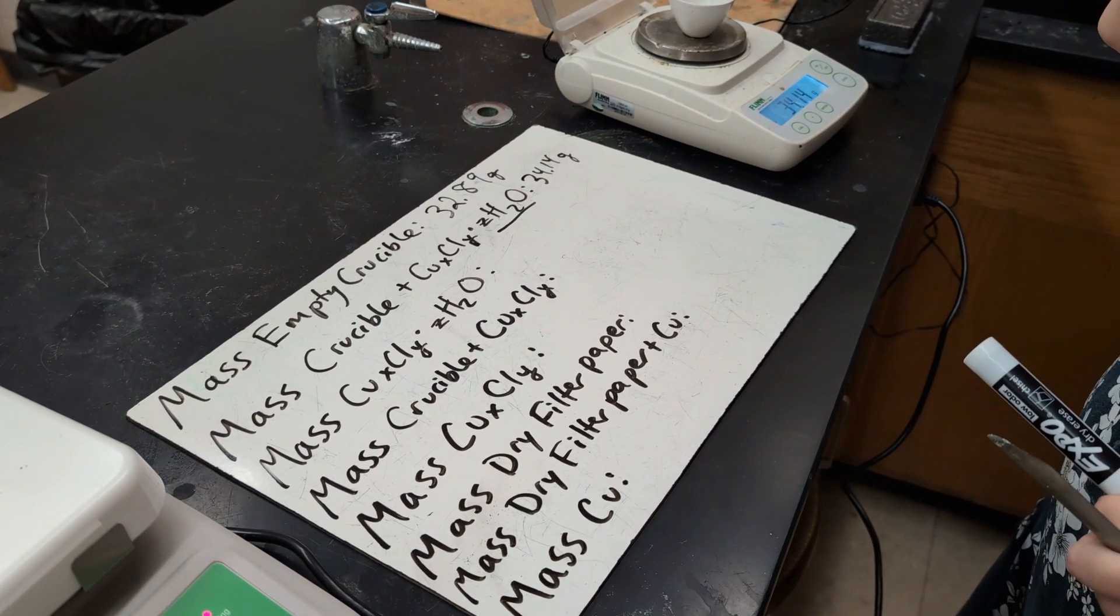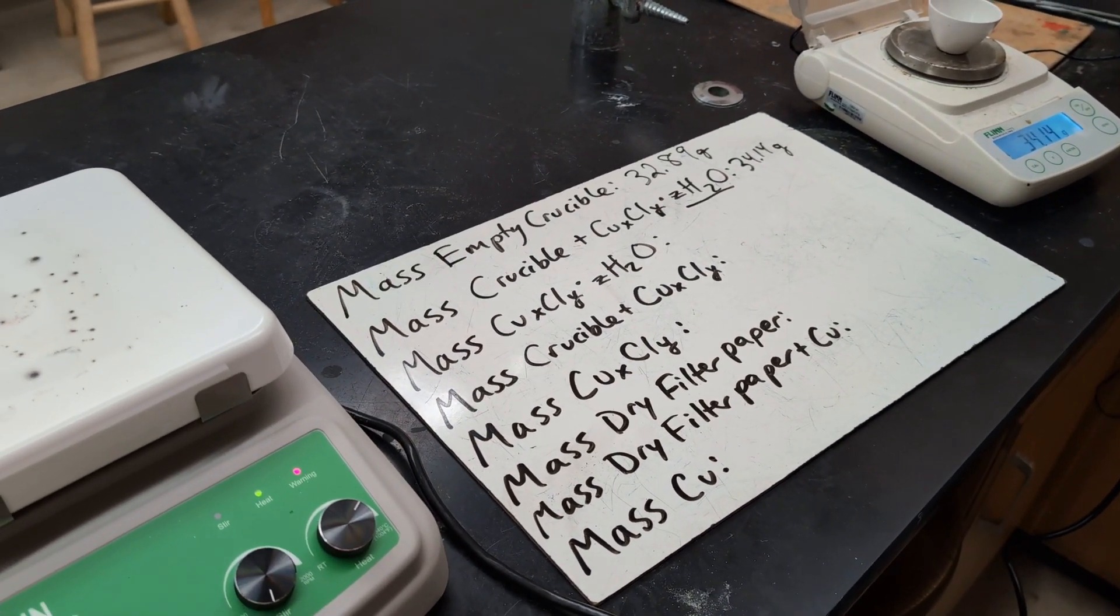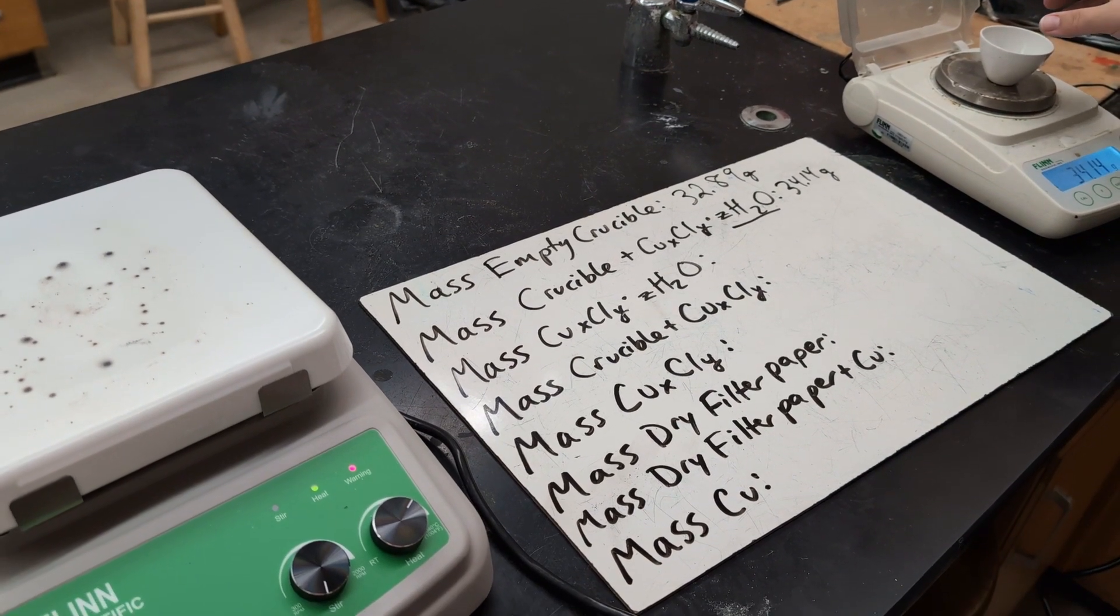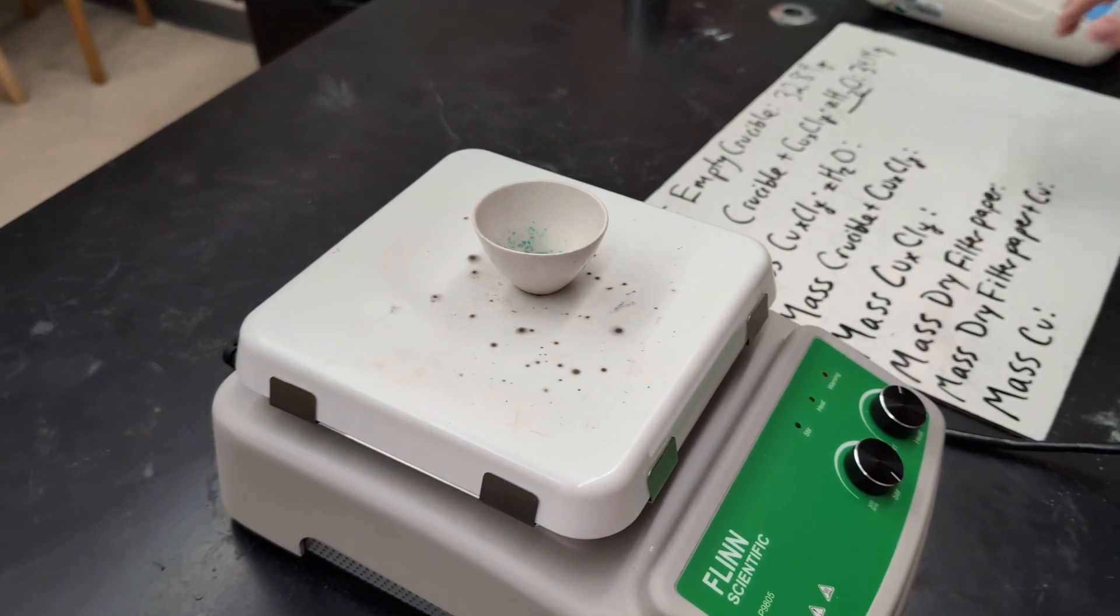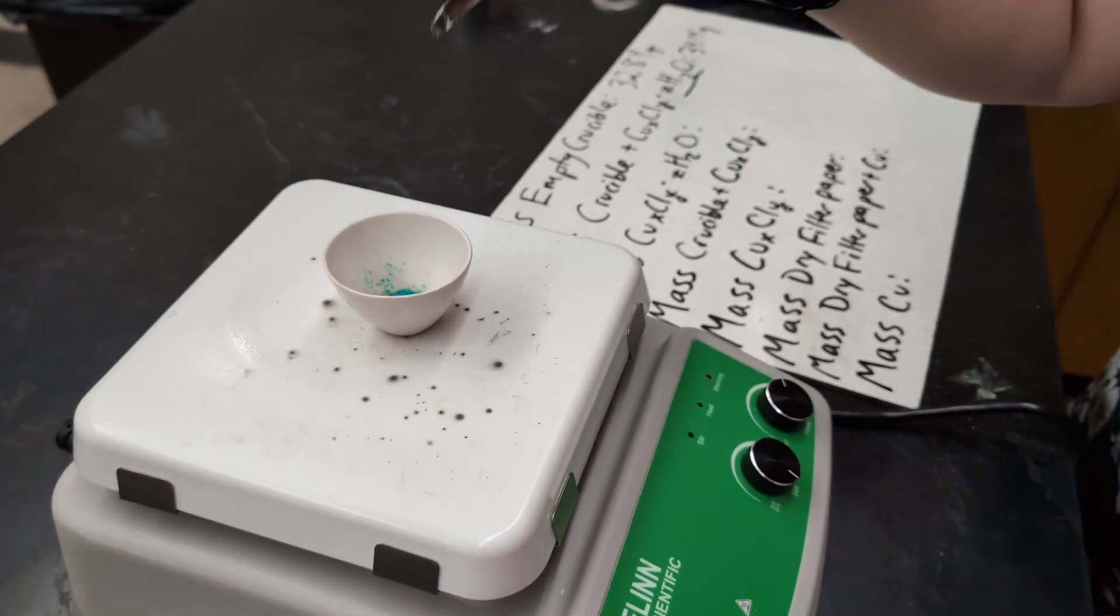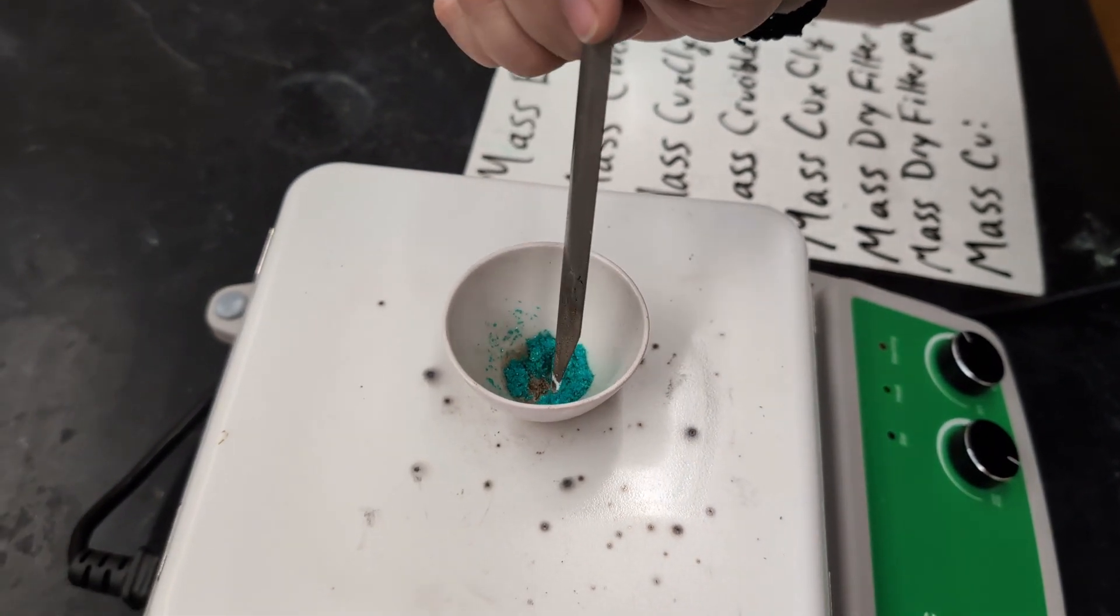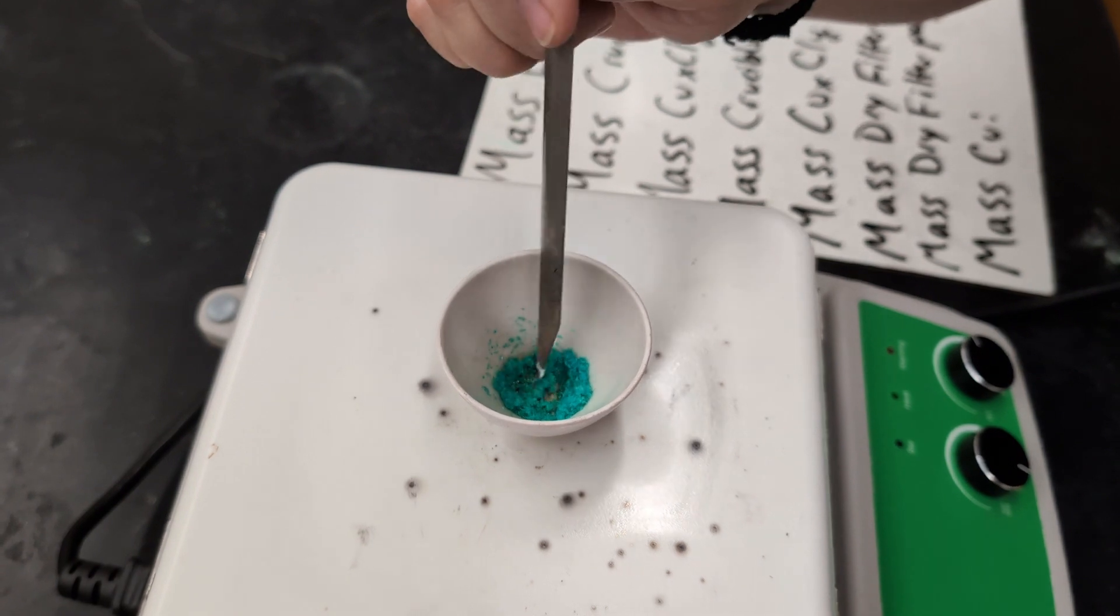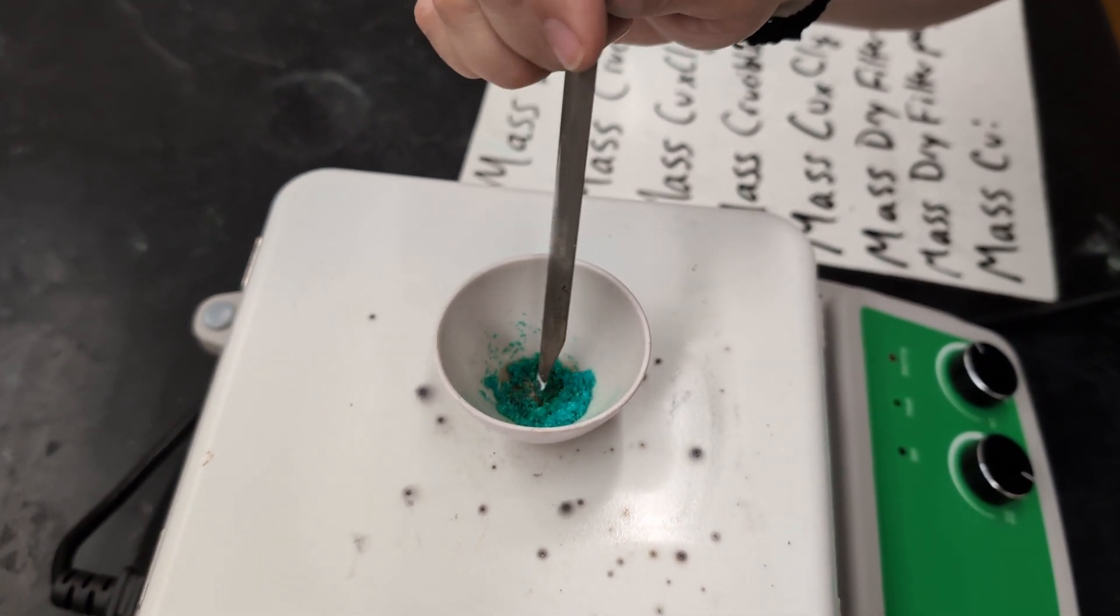Now we are going to heat in order to isolate the copper chloride compound and evaporate all of the water out. So we're going to heat that on a hot plate. You need to make sure that you are continuously stirring so that the compound doesn't burn. If it starts to turn a black color, that's how you know it's starting to burn. But you'll see it turn kind of green and then eventually brown as it is dehydrating.